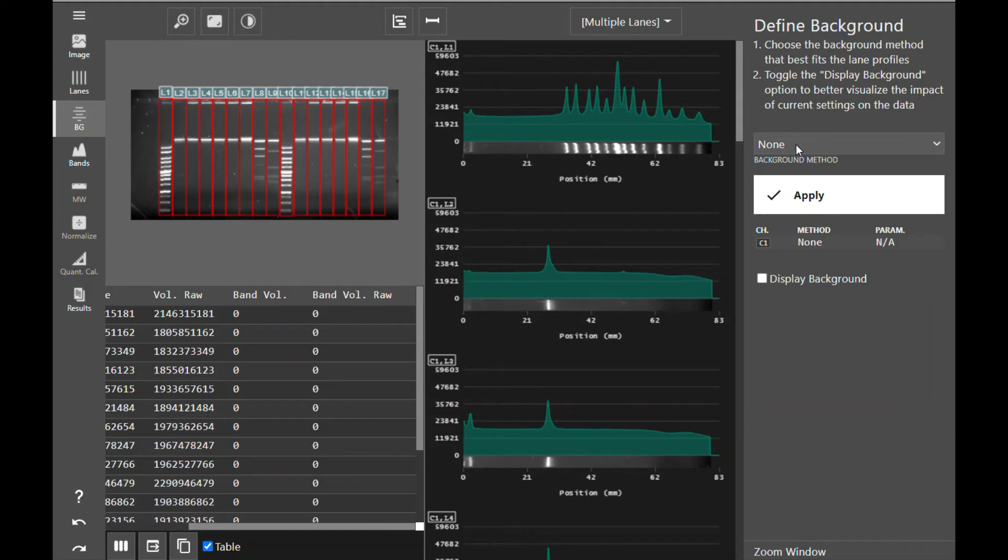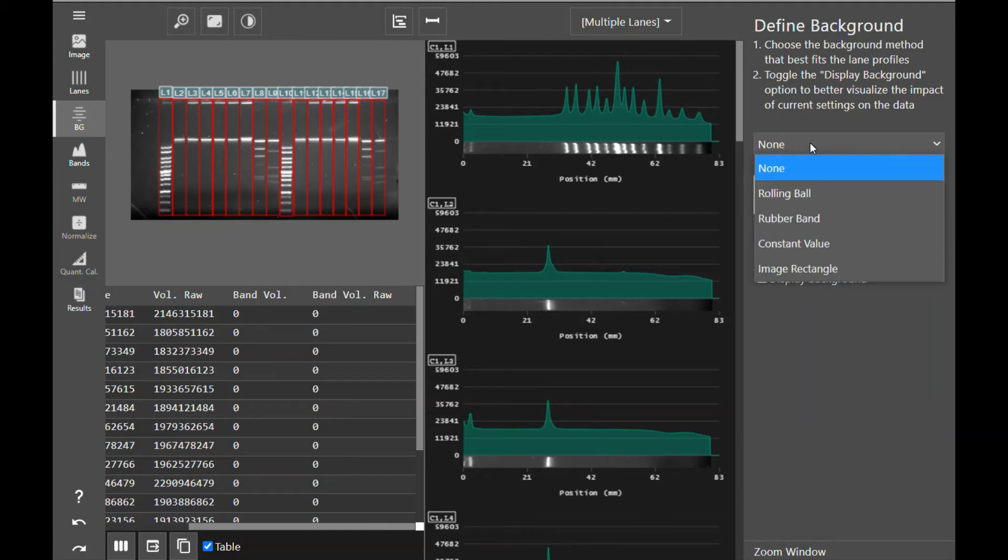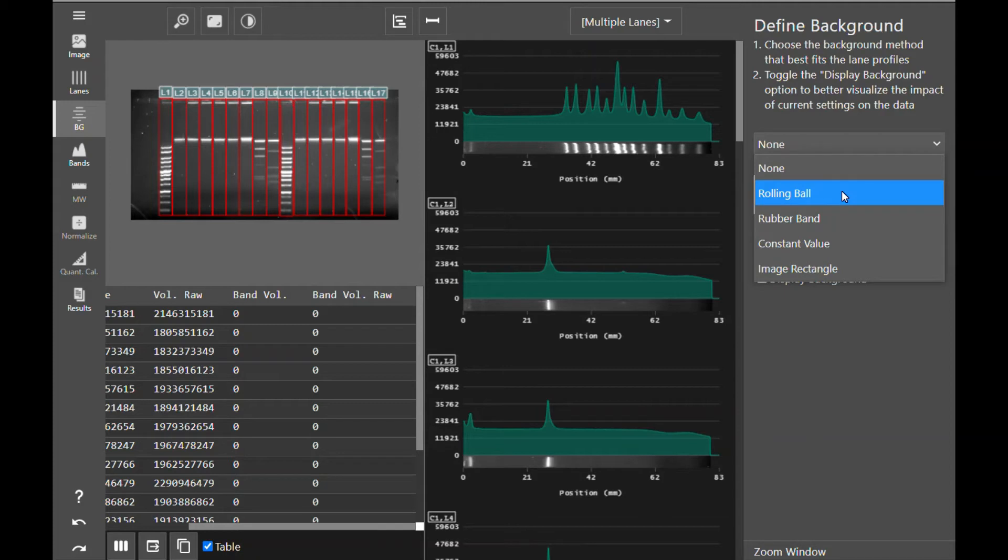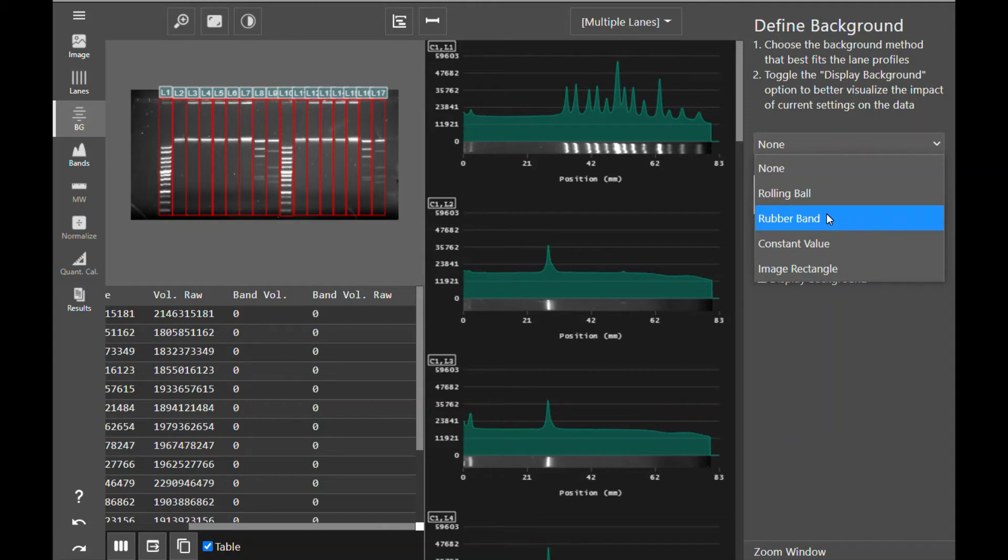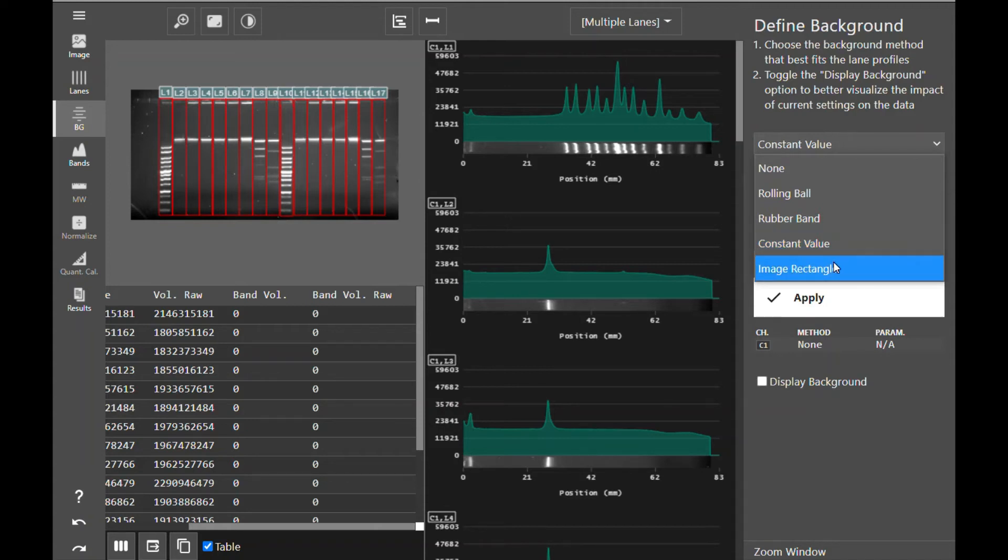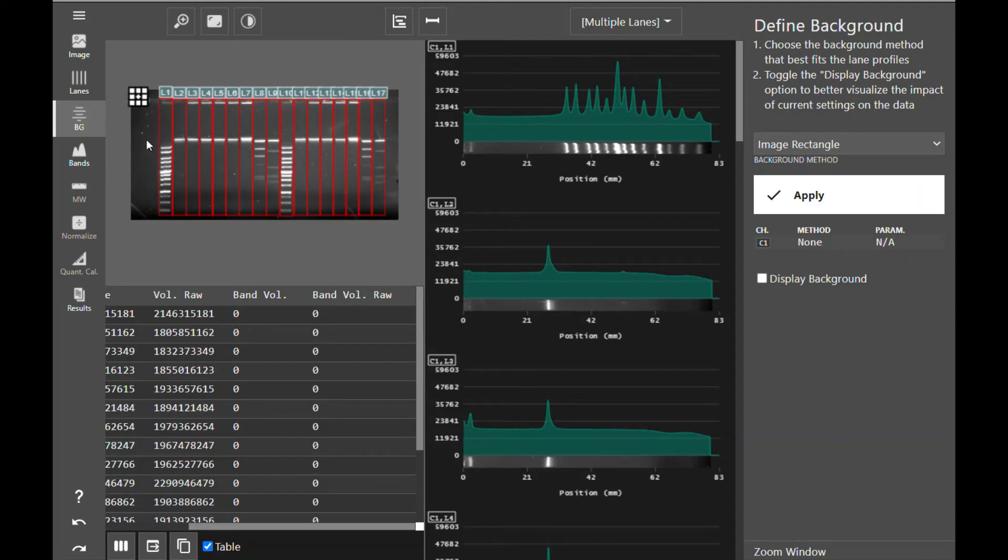Azure Spot Pro offers several background subtraction methods, including none, rolling ball, rubber band, constant value, and image rectangle. None, as you can imagine, subtracts no background from your image. Rolling ball takes an imaginary ball and rolls it underneath your signal and subtracts everything below that as background. Rubber band takes an imaginary rubber band and stretches it up against the profile of your image and subtracts everything below that as background. Constant value will take the minimum value in each profile and subtract that as background, or you can select a value to subtract globally across your entire blot or image. Image rectangle allows you to draw a rectangle on your image and have that subtracted as background.